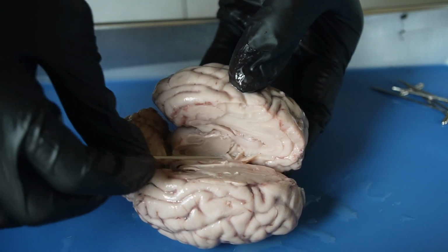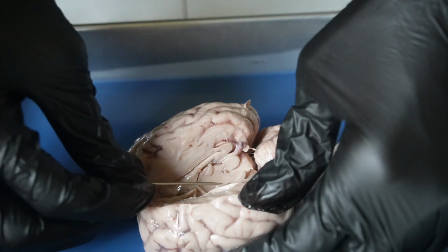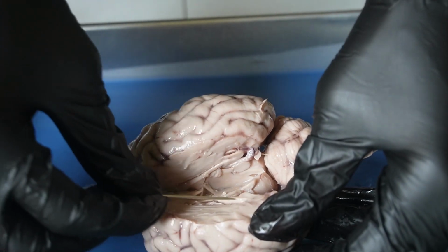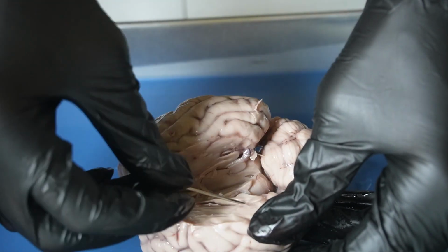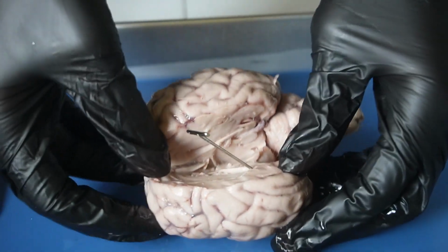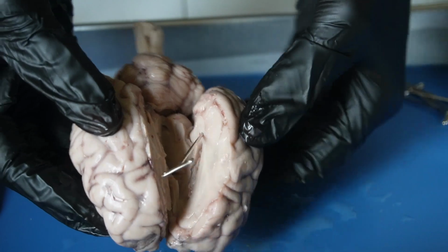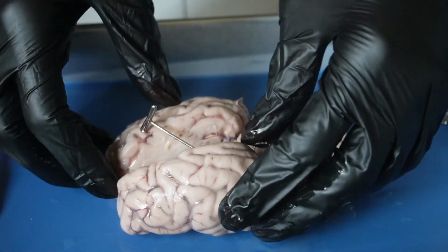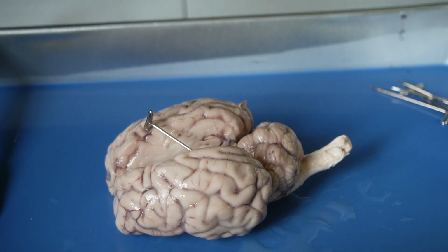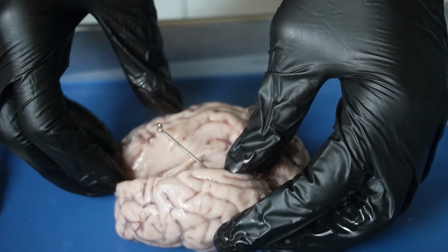So the hippocampus would be here, which is located in the temporal lobe, the temporal region of the brain. And the hippocampus facilitates memory and encoding.